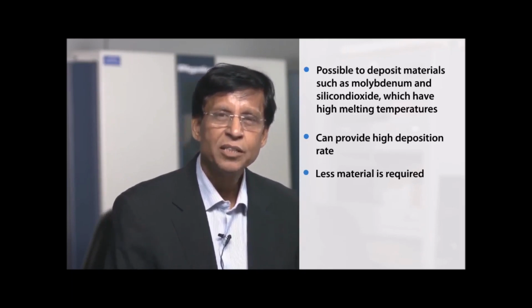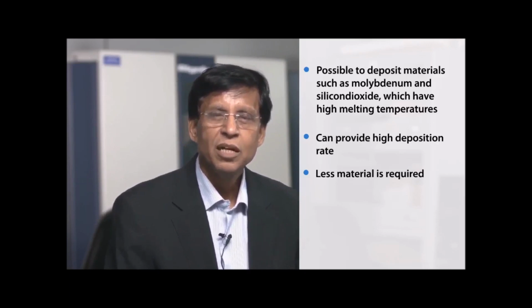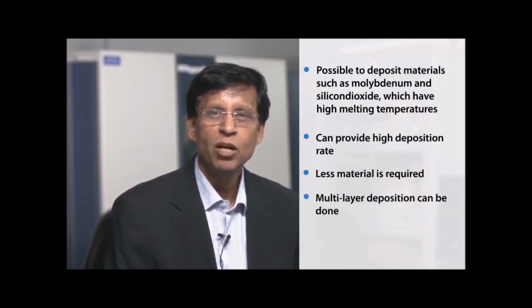Another advantage in this process is that it is possible to deposit multilayer structures, and also a very slow deposition rate is possible. One can grow films very precisely, at the 1 to 2 nanometer level, in a very precise way.